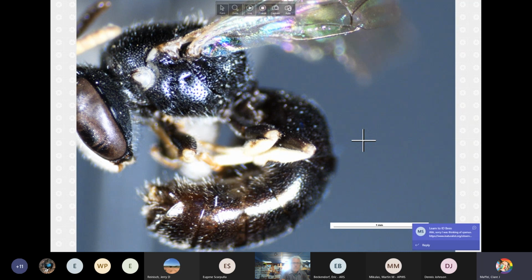the bulk of the characteristics here. A lot of these are the kinds of things where, again, you want some reference collections. So for example, T1, whether there's a presence of minute, often extremely minute pits or not, is useful, but a lot of times you start second guessing yourself. Am I looking at something extremely minute or absent?